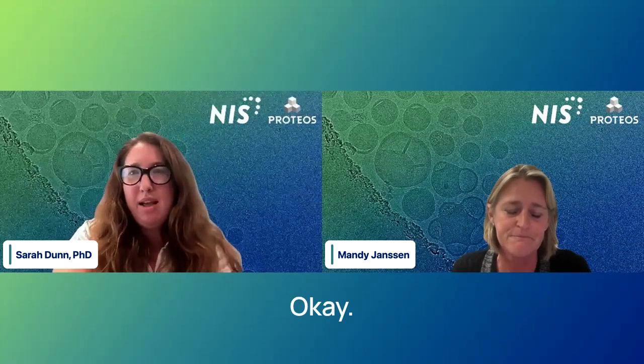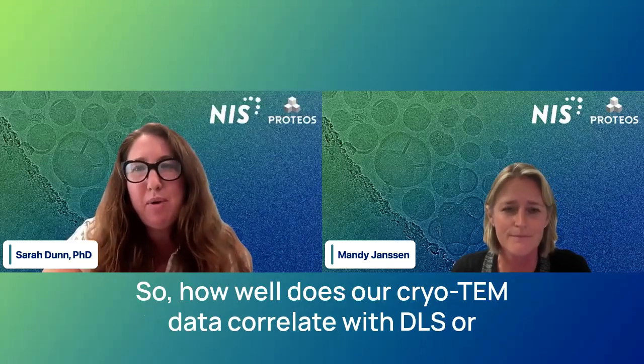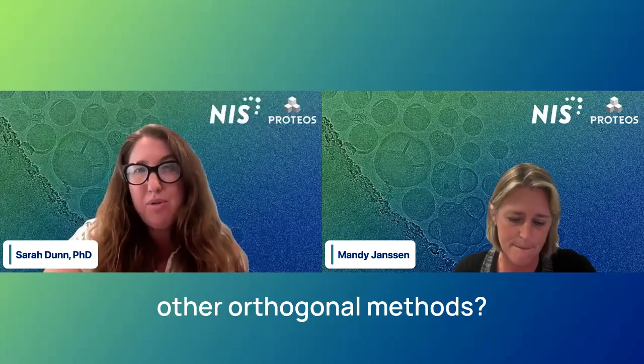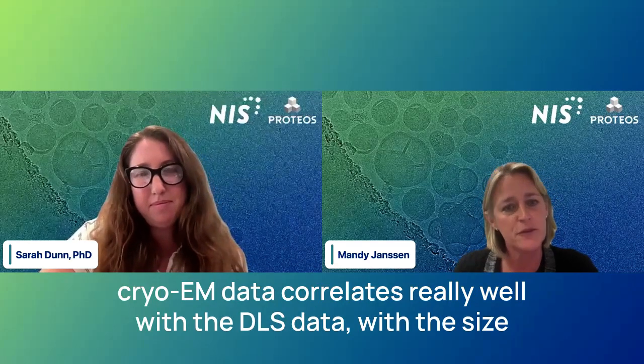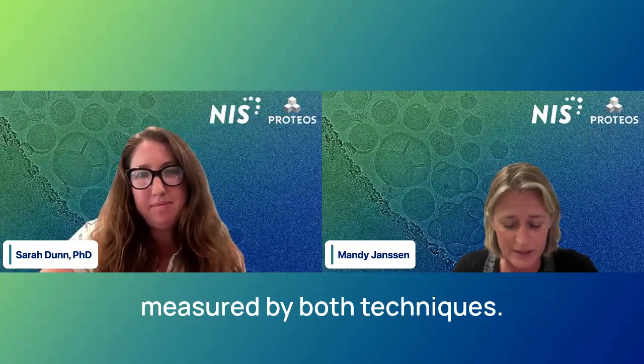Okay. I know you shared some of this data, but maybe we can just summarize it for this question. How well does our cryo-TEM data correlate with DLS or other orthogonal methods? Yeah, so the slide that I showed on the size showed that the Cryo-EM data correlates really well with the DLS data, with the size measured by both techniques.